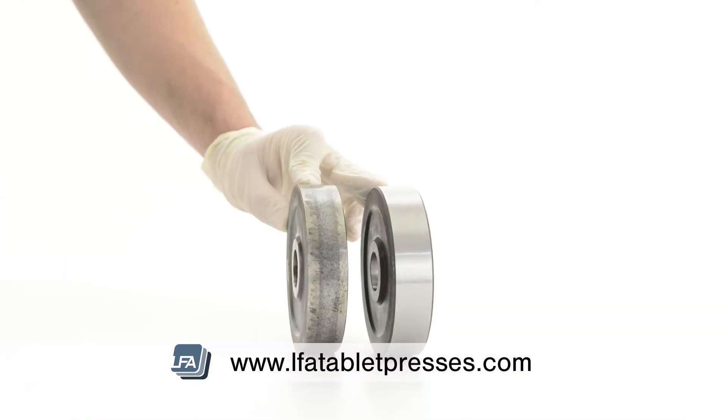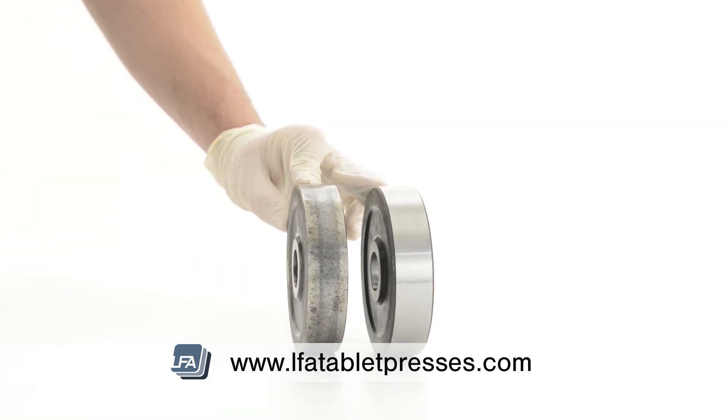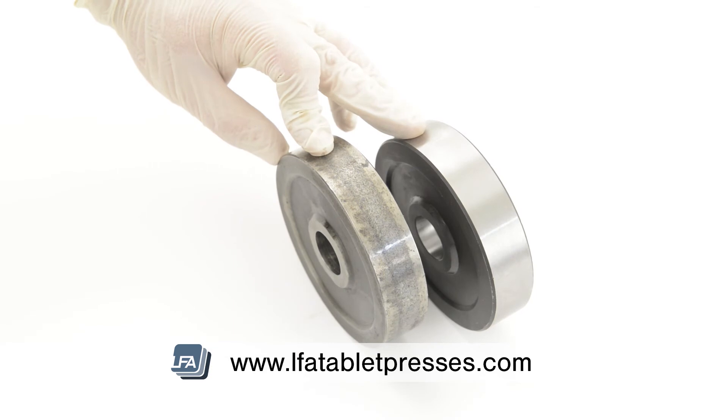Here are two examples of roller cams. On the right we have a brand new roller cam. On the left we have a roller cam which has wear, but wouldn't need to be changed at this point as it's not excessive wear.